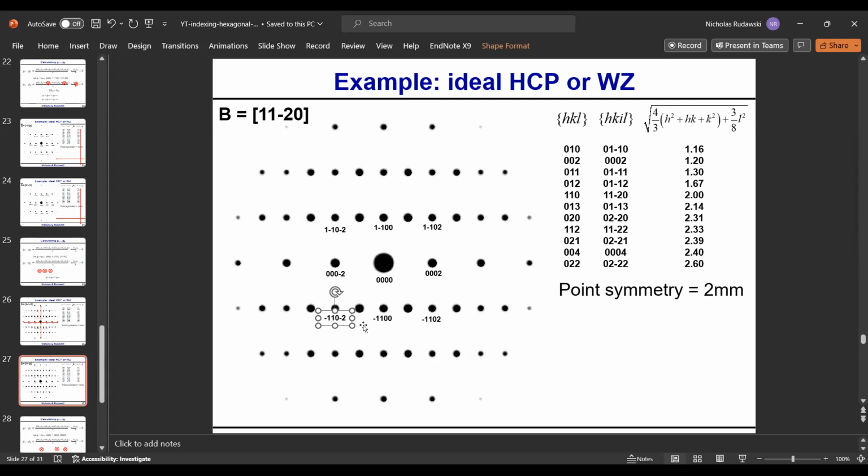Okay, and then we'll do these last remaining 4 spots here, assuming we've got the room. So that's going to be a -1. And that's going to be a 1 instead. That's going to be a 1. And that's going to get put to a -1. Okay? All right. So there it is, re-indexed with the soft rules.